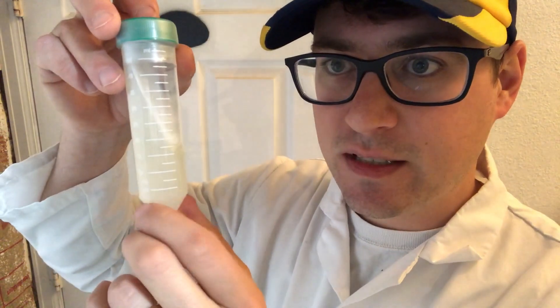There are some pretty good arguments for why you'd want to put some wood in your slant, but you can see from this example that the mycelium is just starting to dig in right here. So I don't see a reason why you'd have to add a piece of wood — it's just another step.